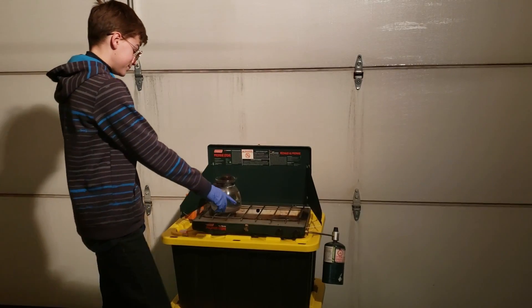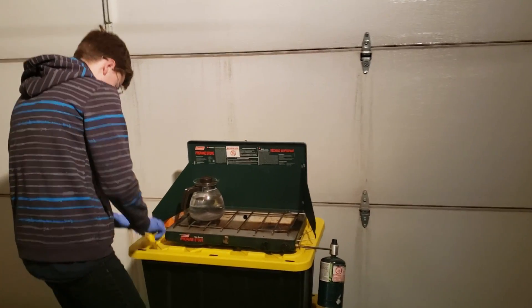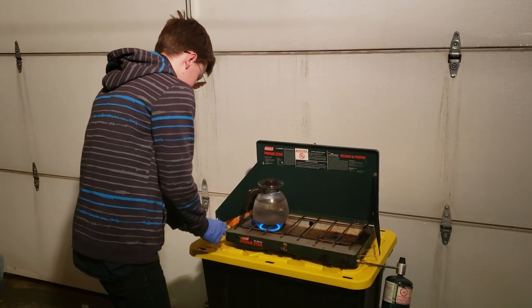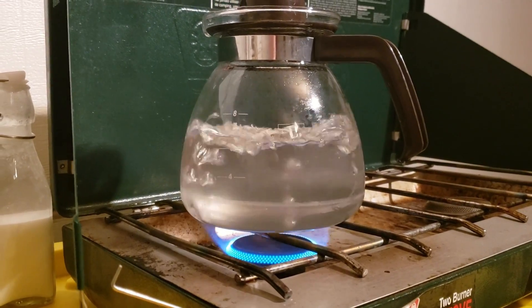Now I will start boiling my car battery acid. I could do an extensive commentary, but my pubescent voice is too pretty for that. Yay! It's boiling!